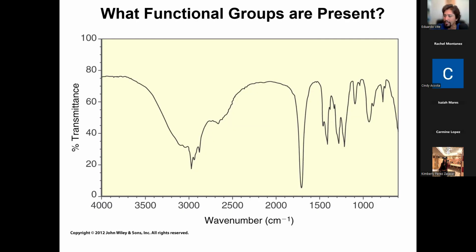Okay. So let me check the time, make sure we're doing good. Yep. Alrighty. So you tell me now. You guys have to tell me now. And ask me and guess, it's okay. What functional groups are present in the spectra based on everything we just went over? And I'm gonna mute my mic, and then somebody gives me an answer on the chat, or you can unmute and tell me what you see. So what functional group is present in this spectra?